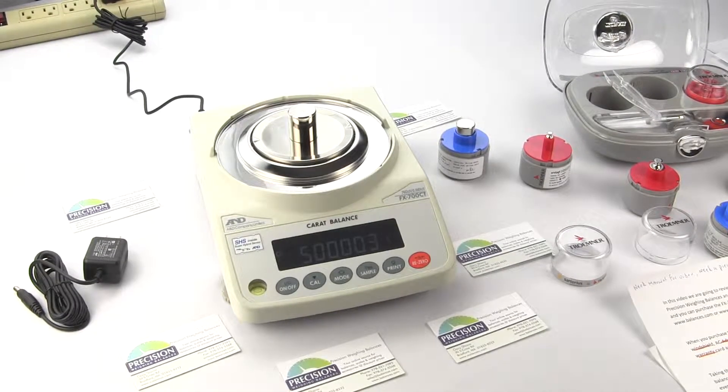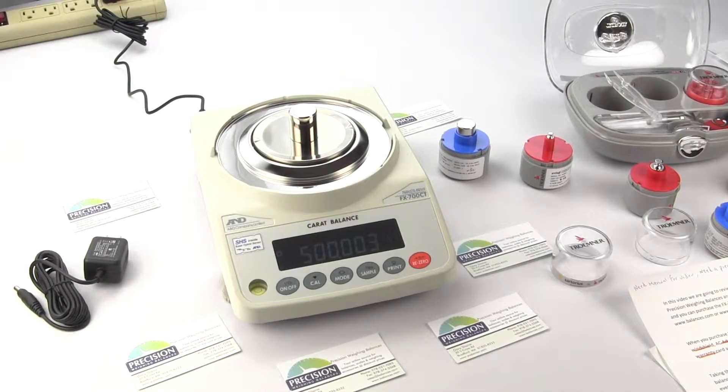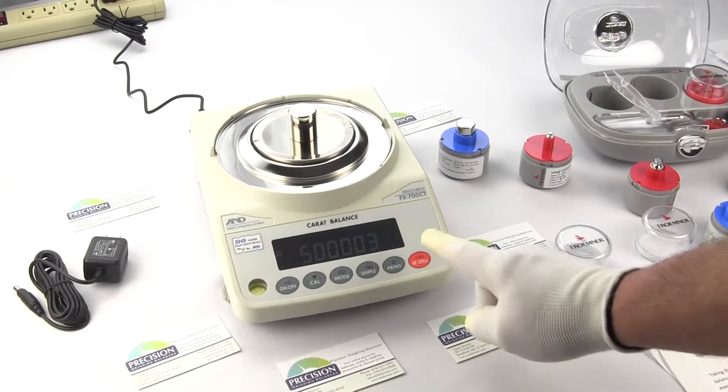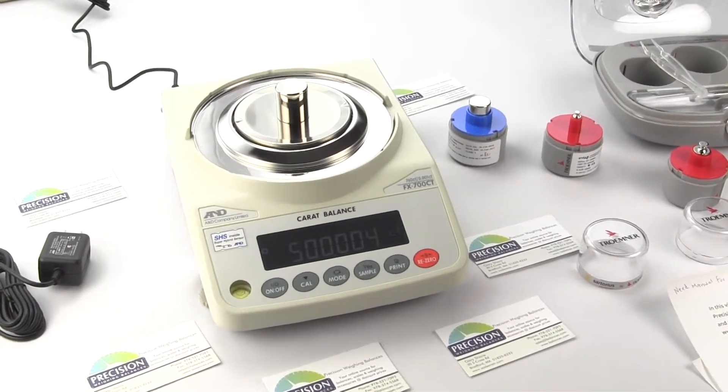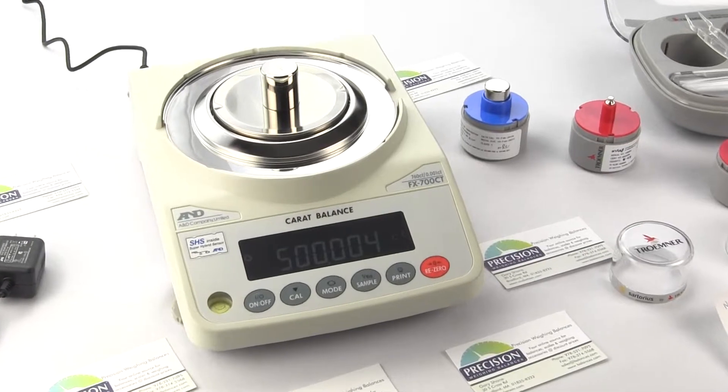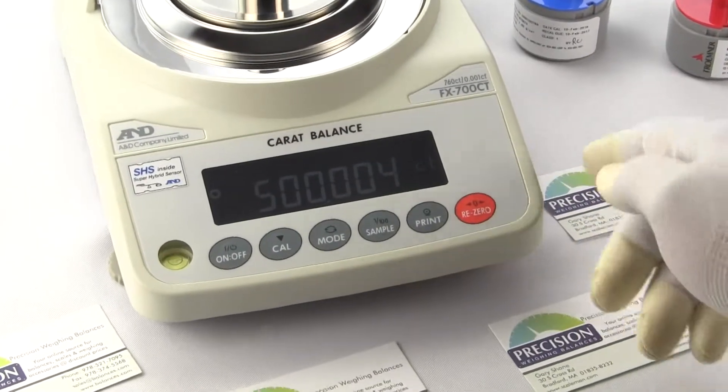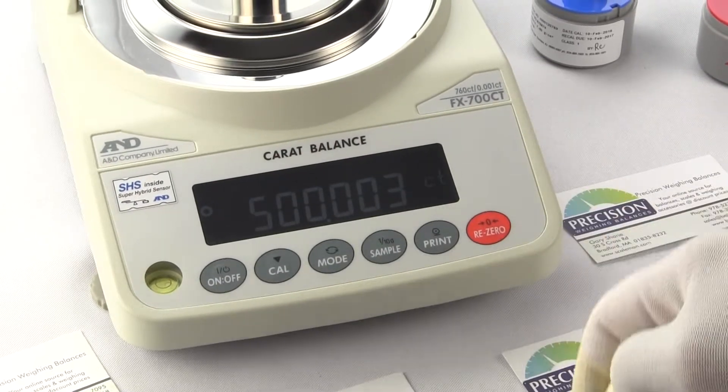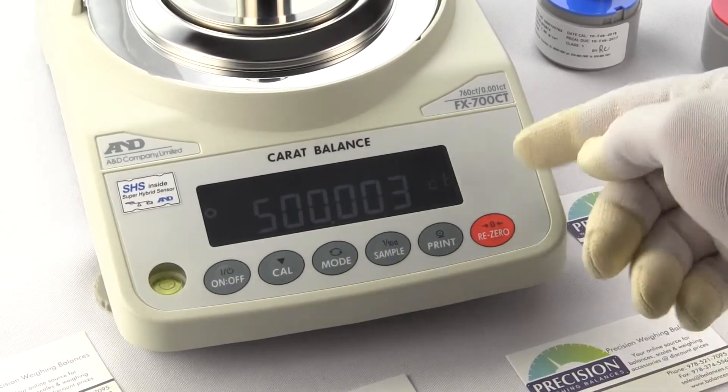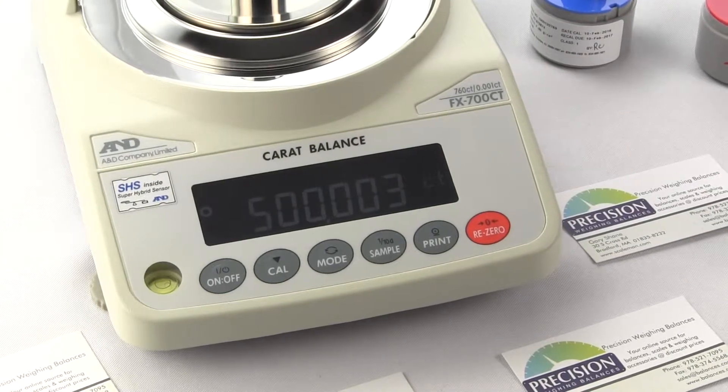The clear simple reverse backlight LCD display offers optimum viewing. So on the FXI series it's a vacuum fluorescent display. This is a larger display and we're using some strong lighting here so you might not be able to really see how nice this display is but it's a reverse backlight LCD display.